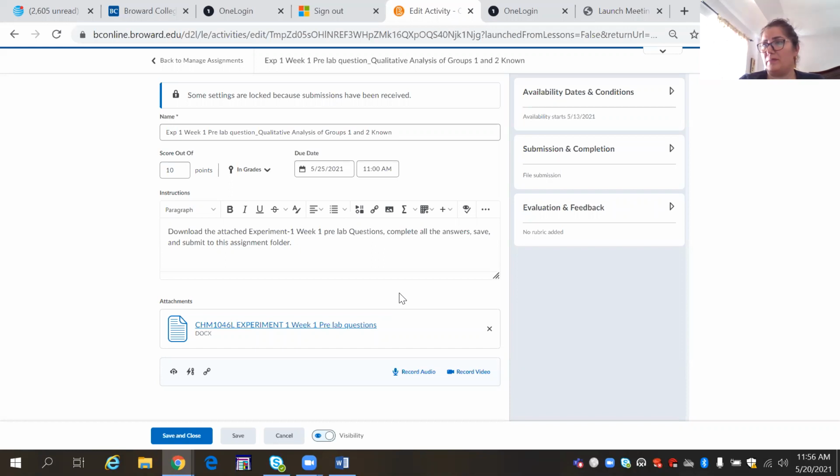The experiment, when you watch the video, is you're recording what you see, and you're not the only one watching that video. Everyone in class is watching the same video. So if there is a precipitate forming, yes, there is a precipitate forming, and then you would say precipitate is forming. If there's no precipitate, then there is no precipitate.